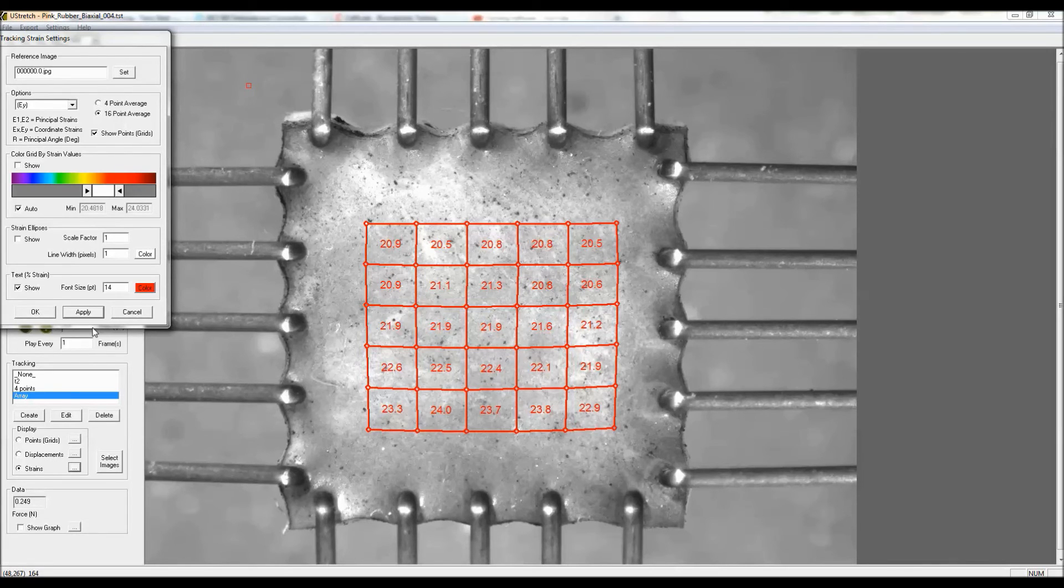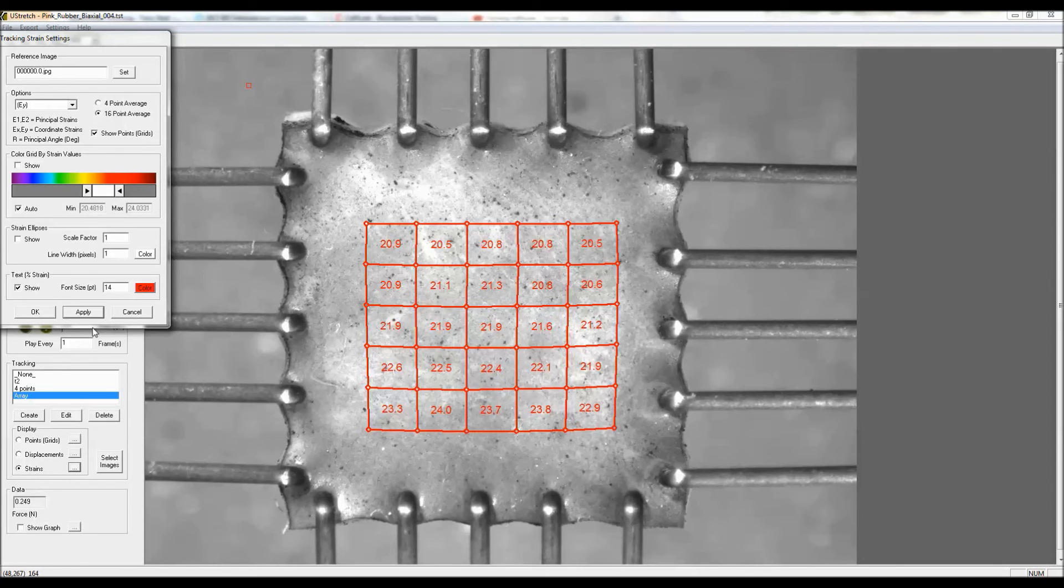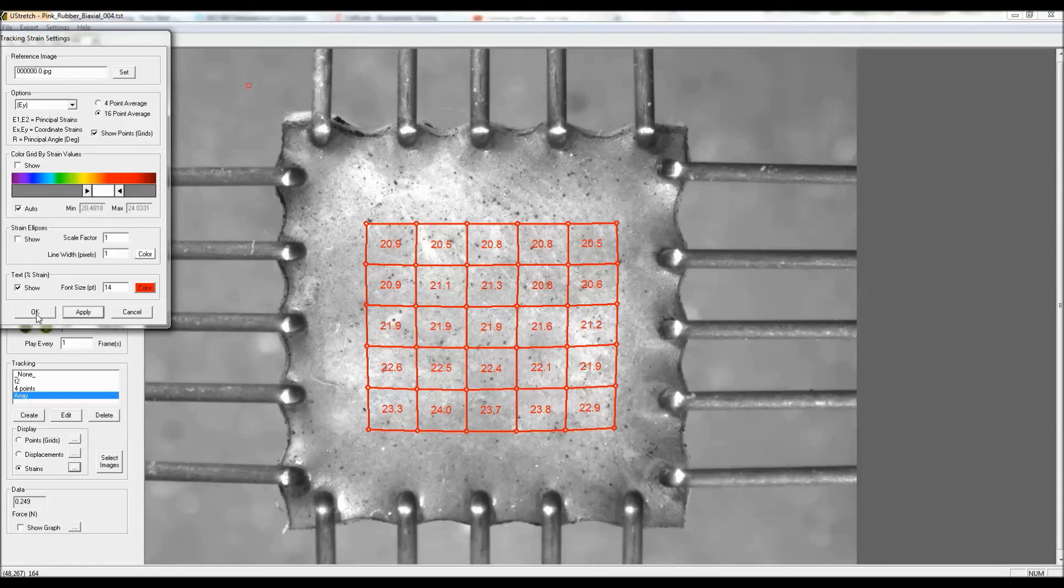And also what we can look for is areas of the specimen that are not seeing uniform strain due to variances in the thickness or the material properties at various points, or maybe there's some local failure. So we can see a lot of different things.